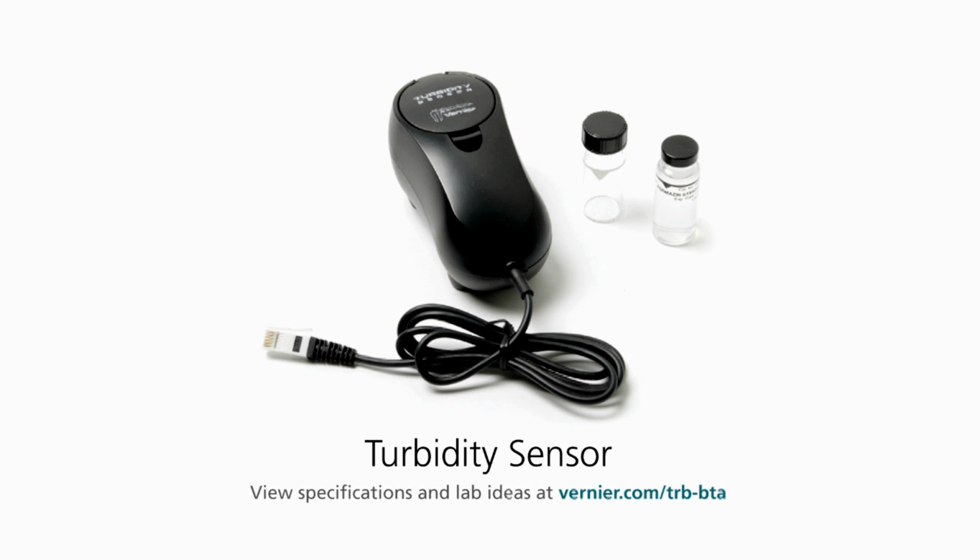Today, I'm going to talk about the Vernier turbidity sensor and using it with our LabQuest 2. The Vernier turbidity sensor is often used with water quality measurements to be able to measure the amount of turbidity that is in a water sample.